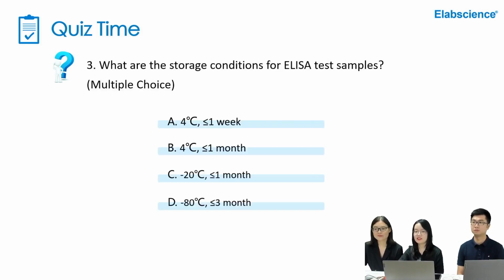Quiz 3. What are the storage conditions for the ELISA test samples? It's also multiple choice. This part is included in the sample preparation method, right, Vivian?